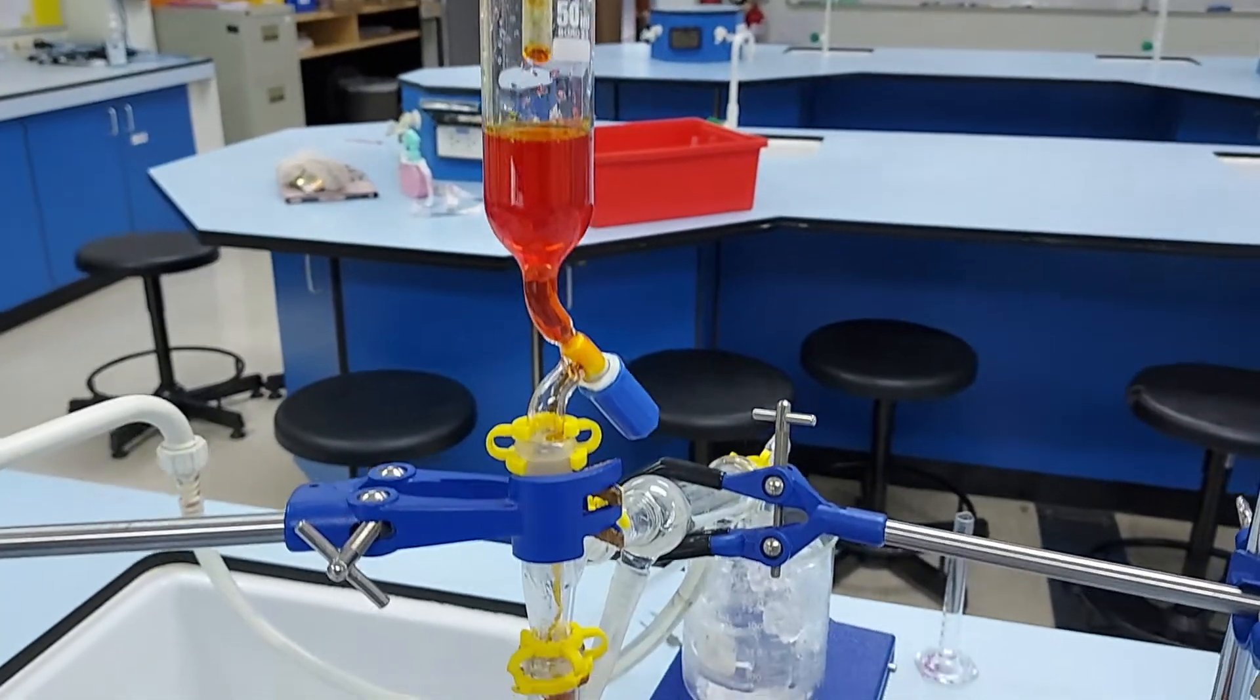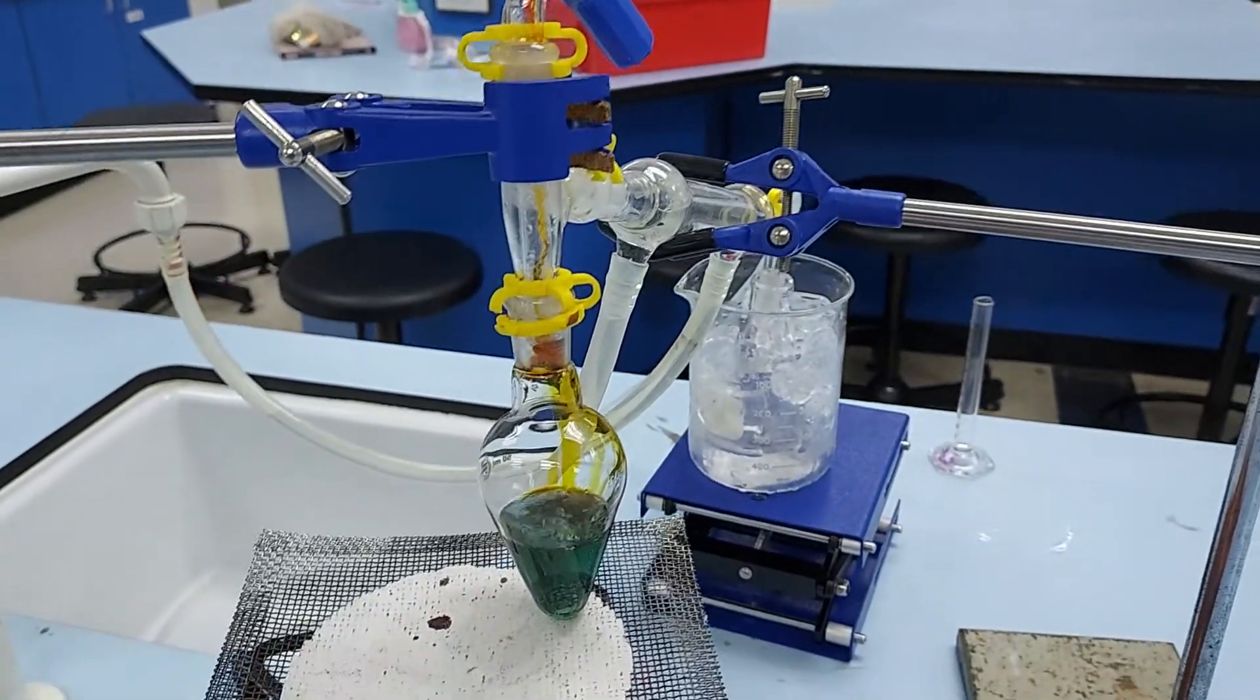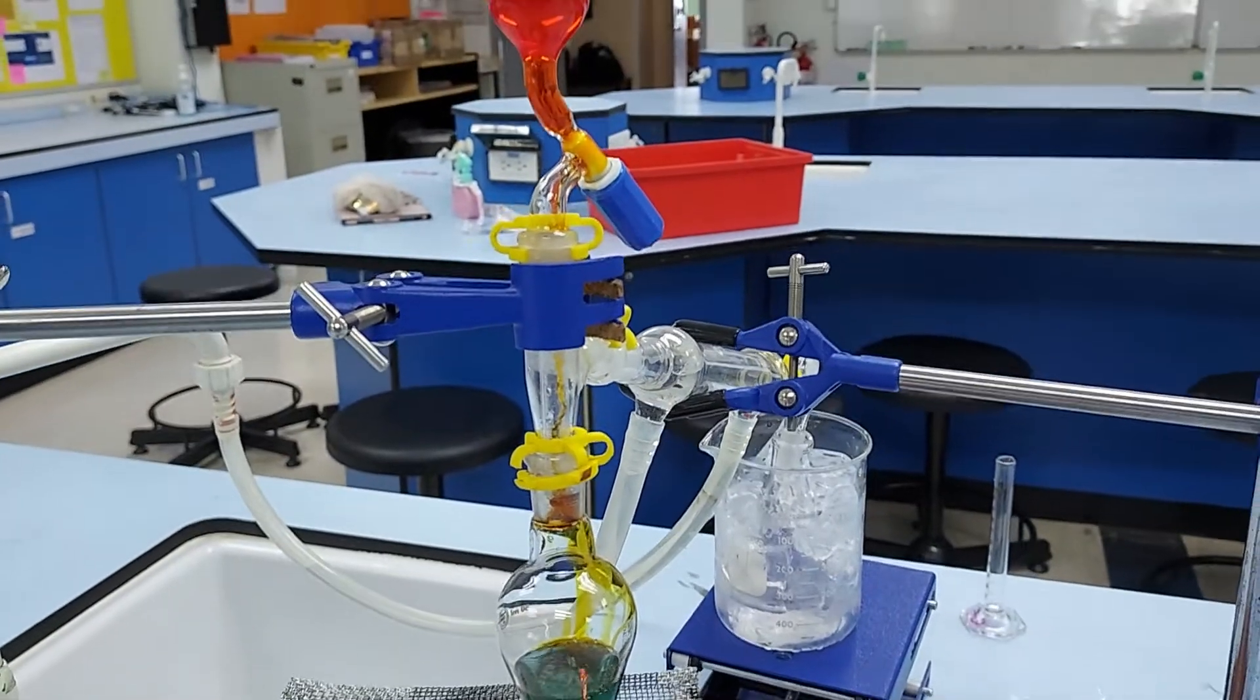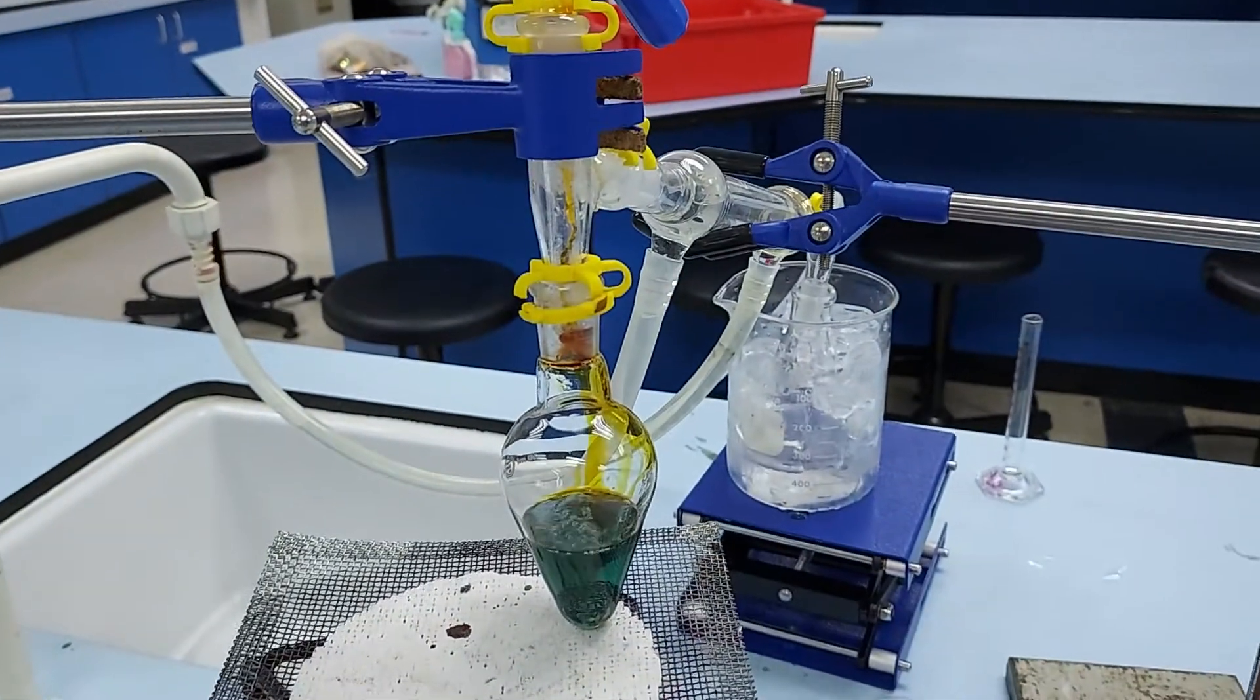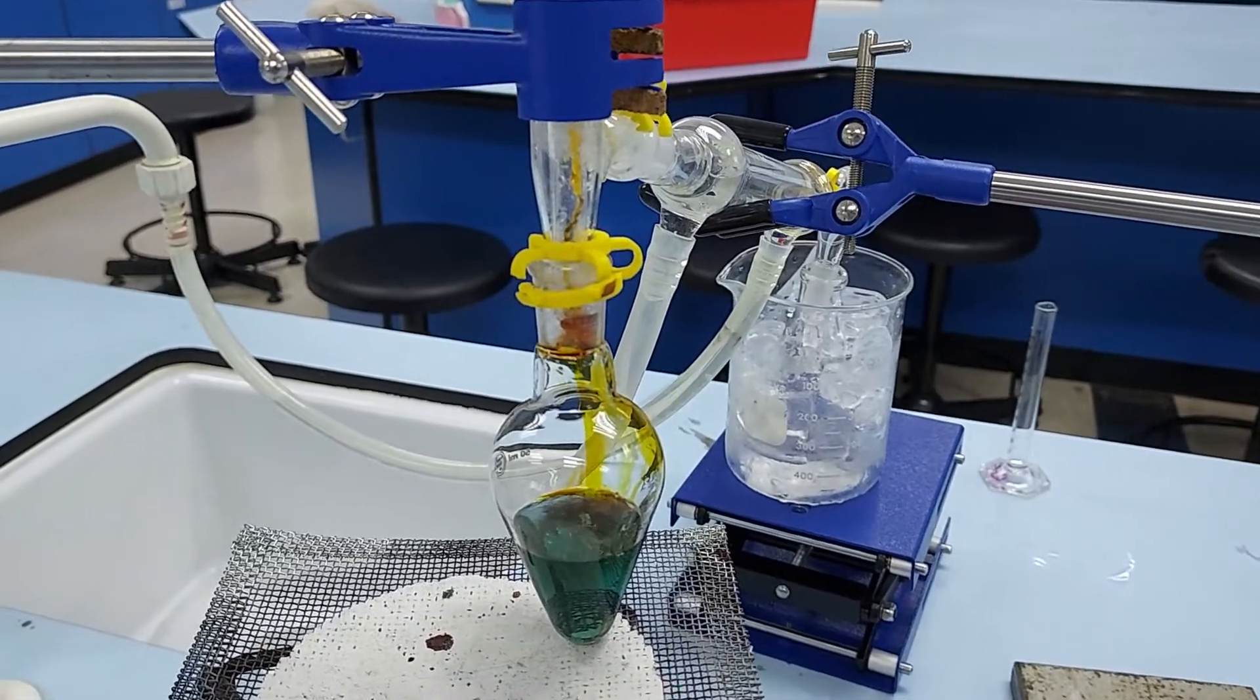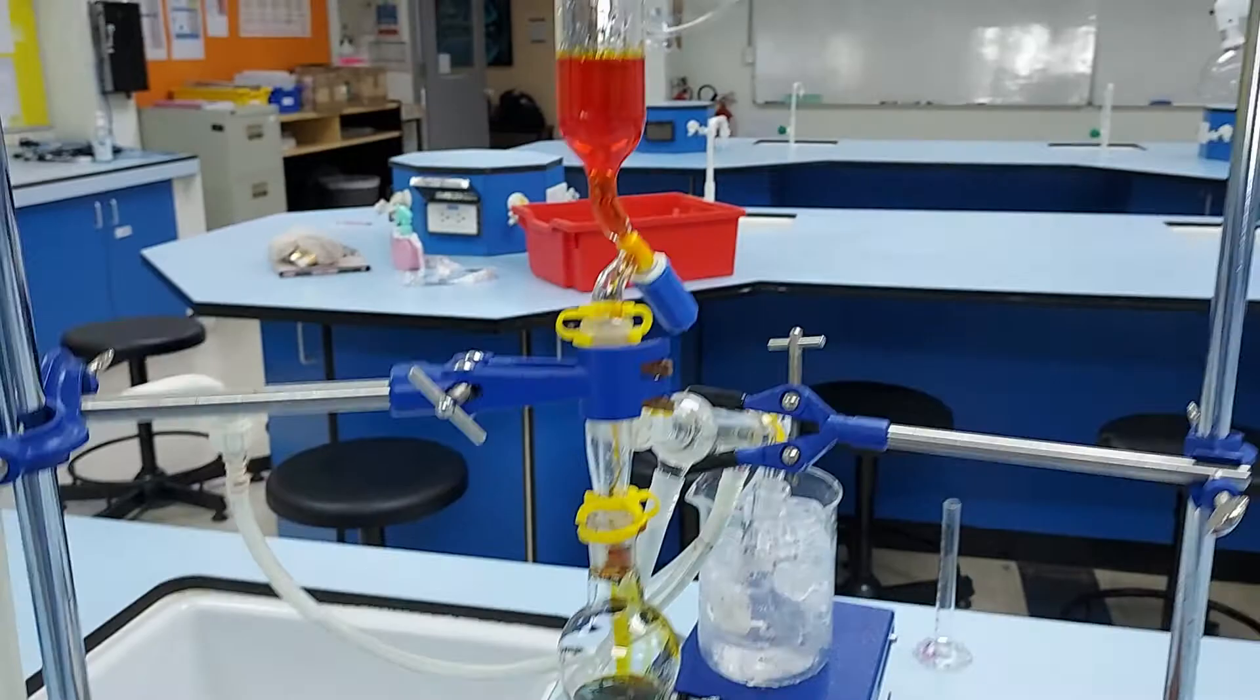We can see here the reaction mixture is being slowly dripped into the flask and look at the colour change. Now we know the alcohol has been oxidised because our chromium has been reduced from plus 6 to plus 3. Look at that beautiful green colour as opposed to the orange.